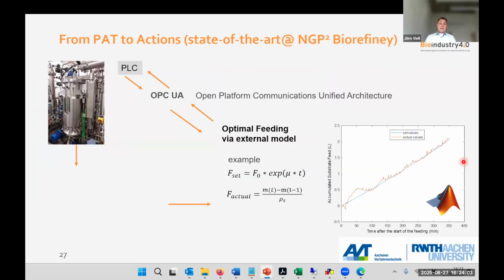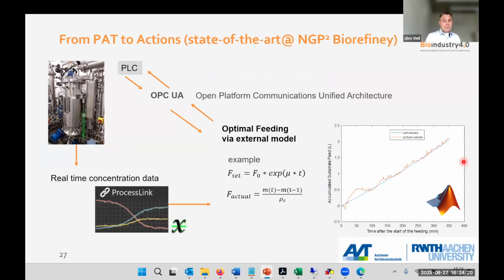So last slide, I promised to give a note on the application in digital twins, why it is so important for digital twins. Of course, a digital twin would drive us to action. It would not just monitor and quantify. So what we have in our setup is, of course, a process logic control that controls all the valves, the pumps, etc., and sets pressures and flows. And then we have the advanced spectroscopy, Raman, NMR, in order to derive concentrations.